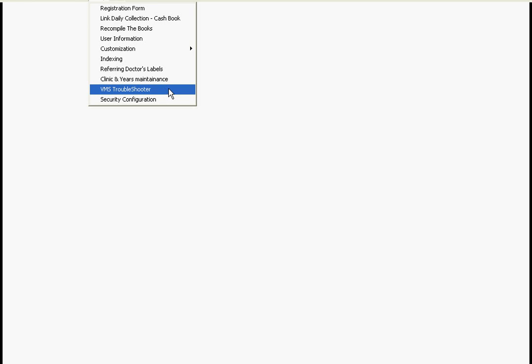So this keeps the health of this package and your data always in good condition. And whenever you start the package the first time in the day, this automatically runs, so you don't have to remember to run it. So by so much experience, we have learned to automate many things which can be forgotten due to human error or ignorance at times, or because of too much workload.